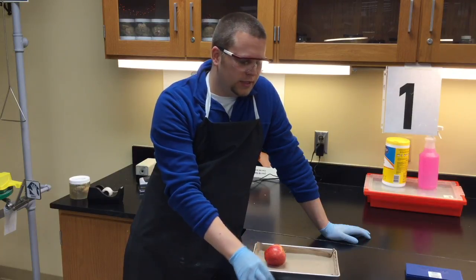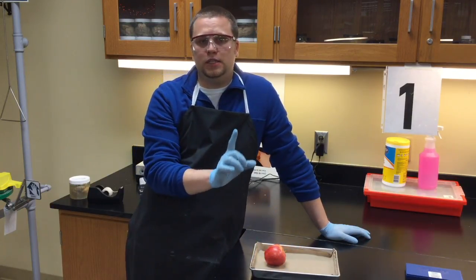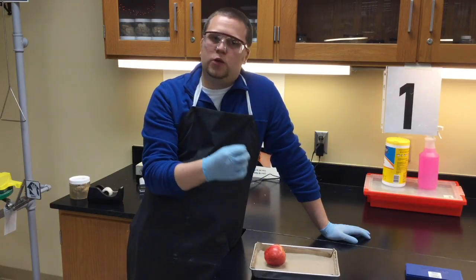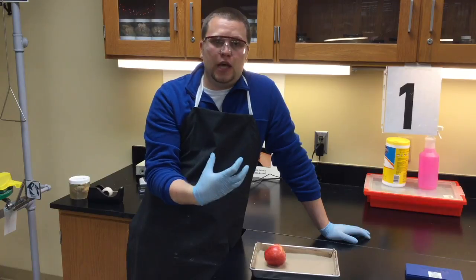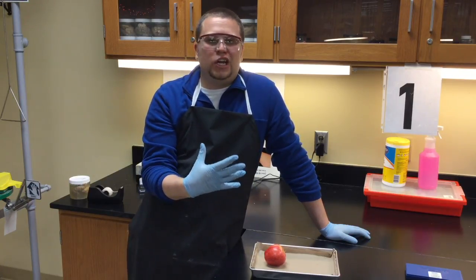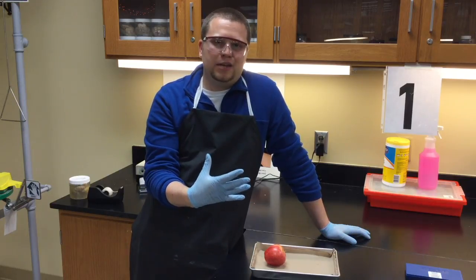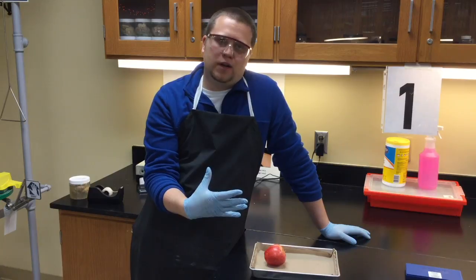Now, when you are using these various different tools, you want to make sure that only one person uses them at a time, and that you are being very careful so that you do not injure yourself or injure someone else around you. It is really difficult to get hurt inside of a laboratory setting, but if you don't follow the safety rules that have been set up, that's when injuries are going to happen.